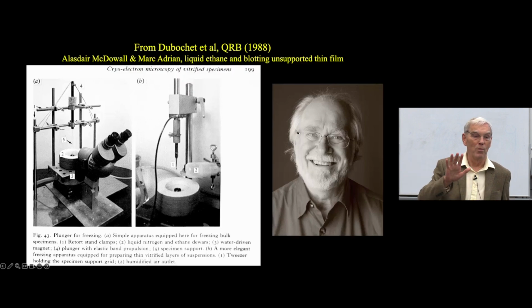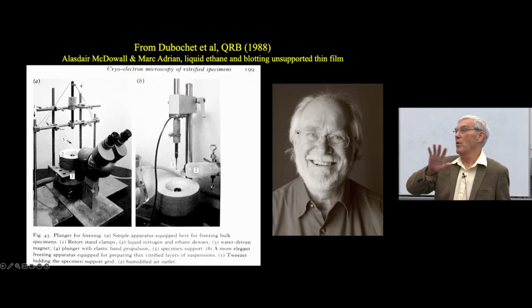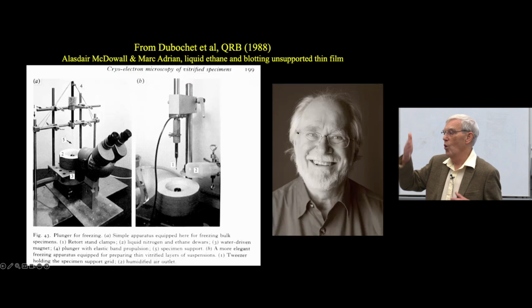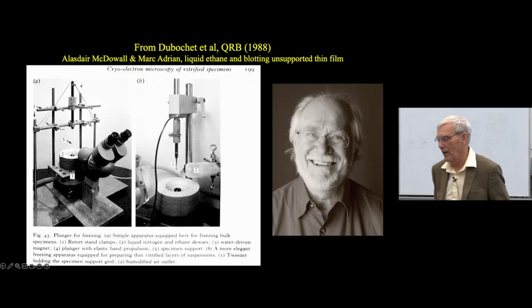And the job, or his target, which was agreed, of course, between them, was that they should try to develop electron microscopy methods, both cryo-microscopy, where you were cooling the sample. They built a liquid helium temperature microscope, and ways of studying the behavior of water so that you could look at it when it was cold in the electron microscope. And this is Dubochet's apparatus.